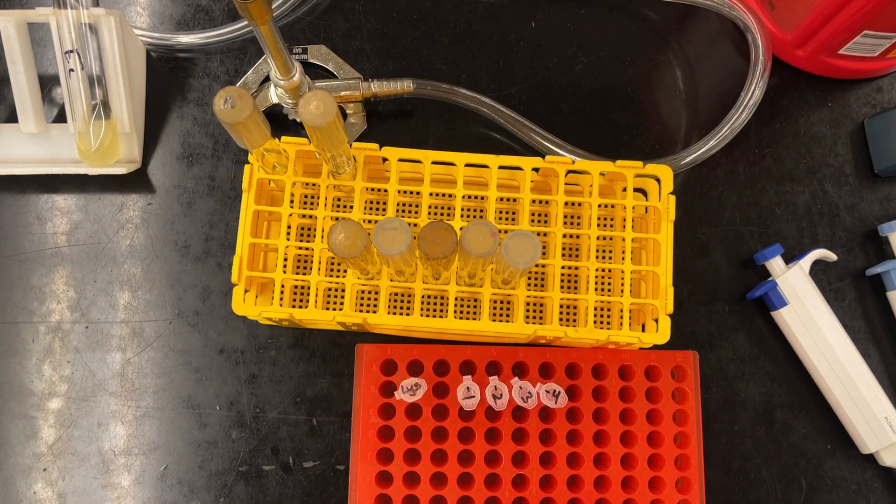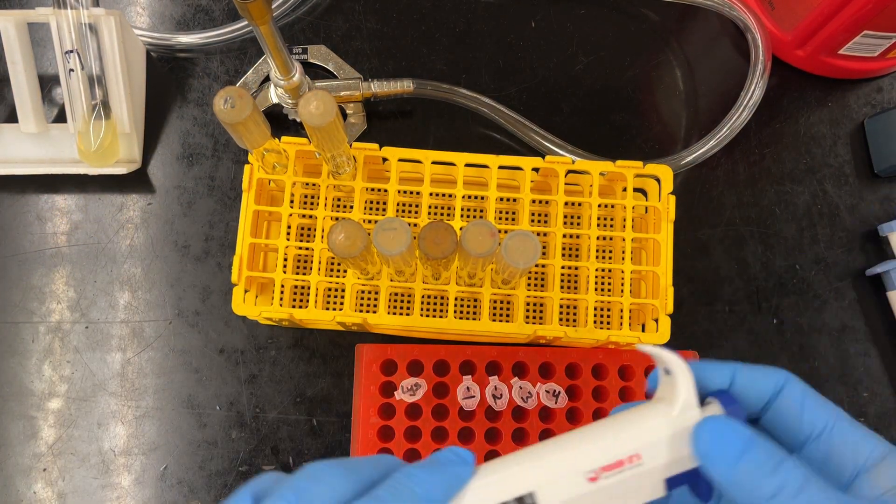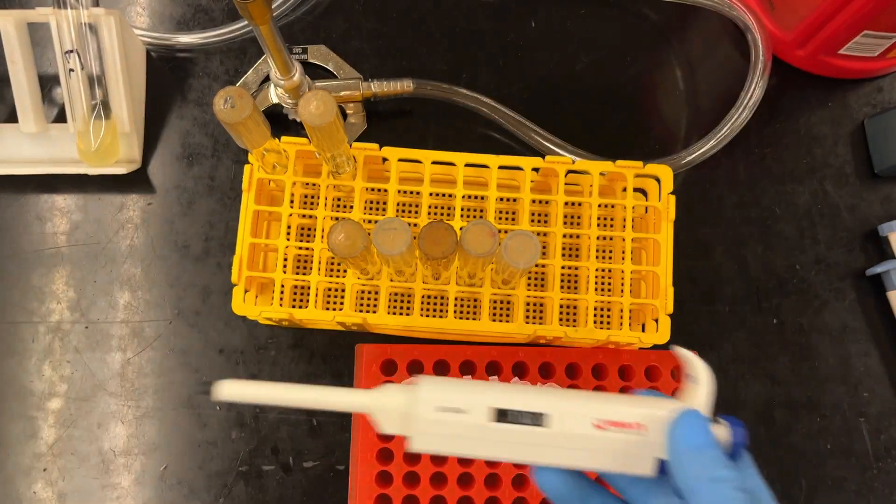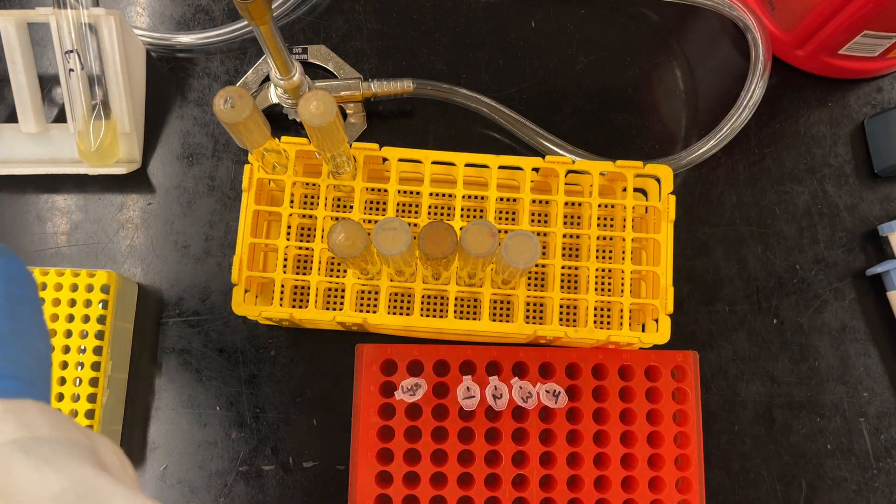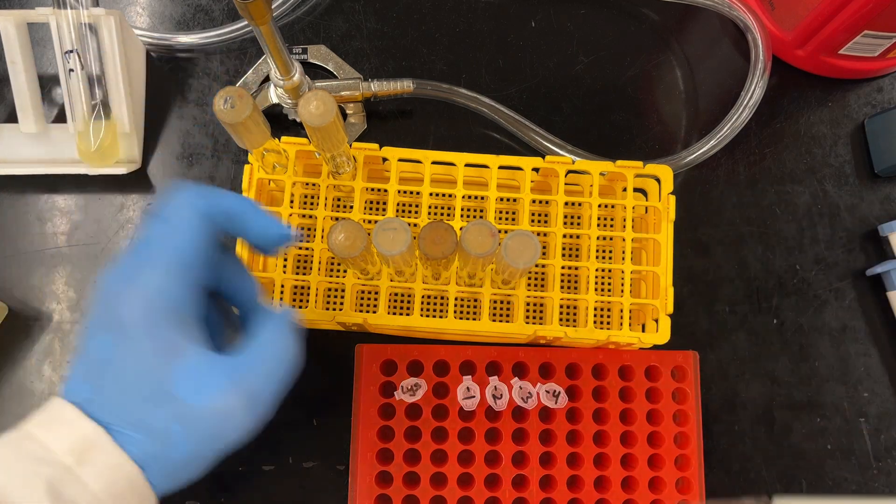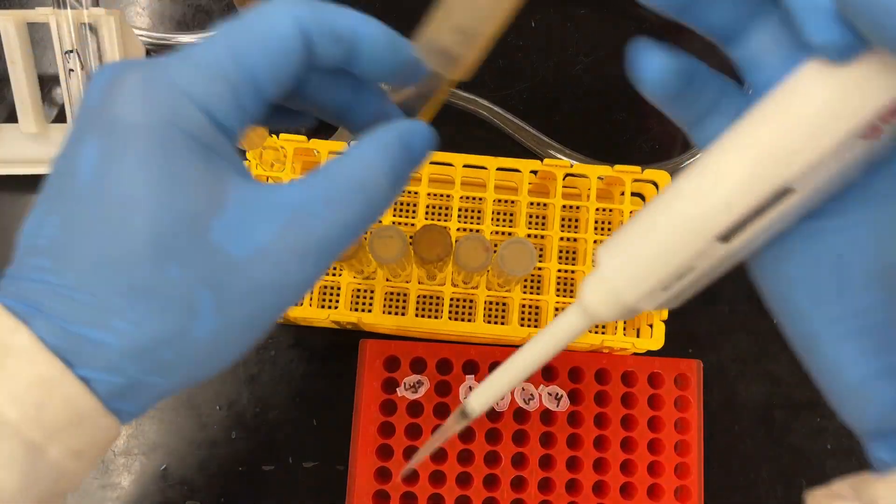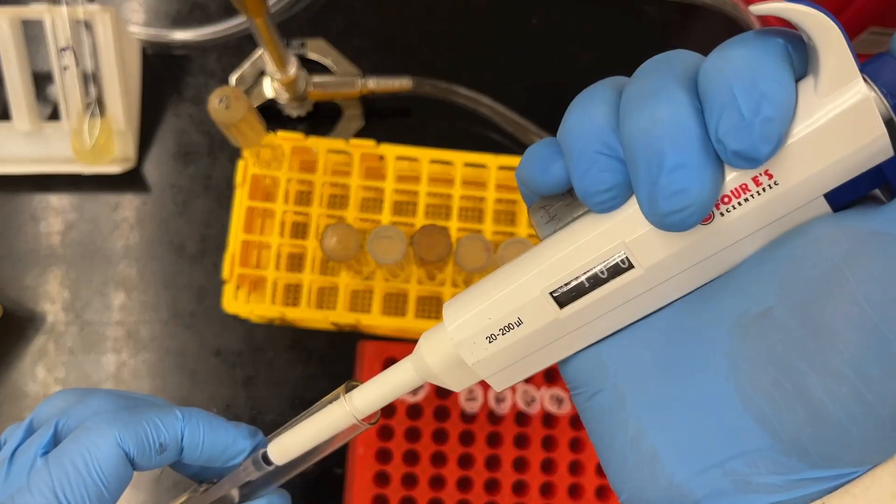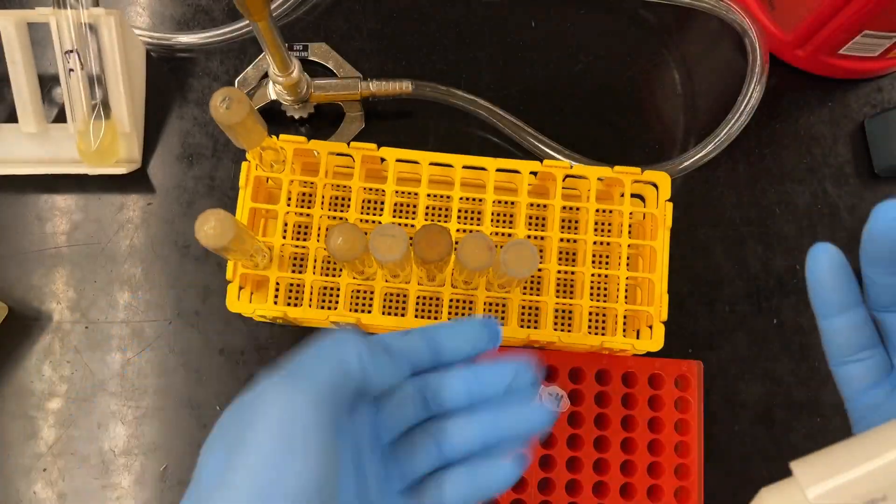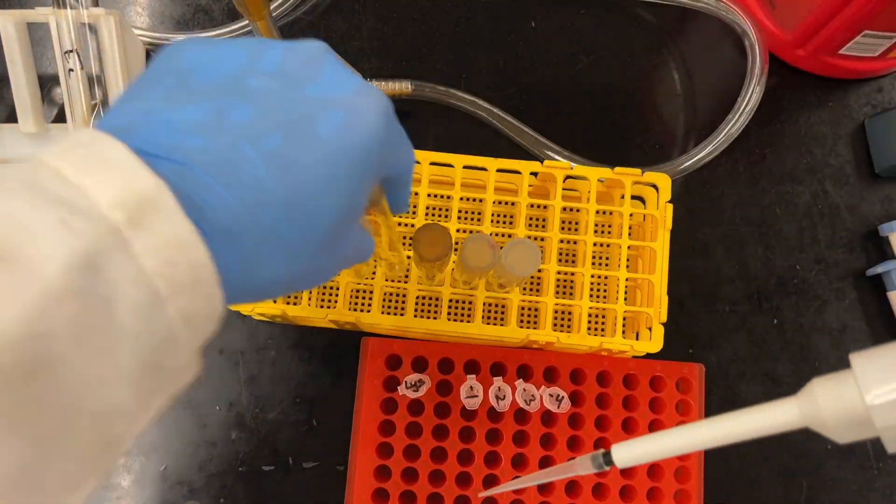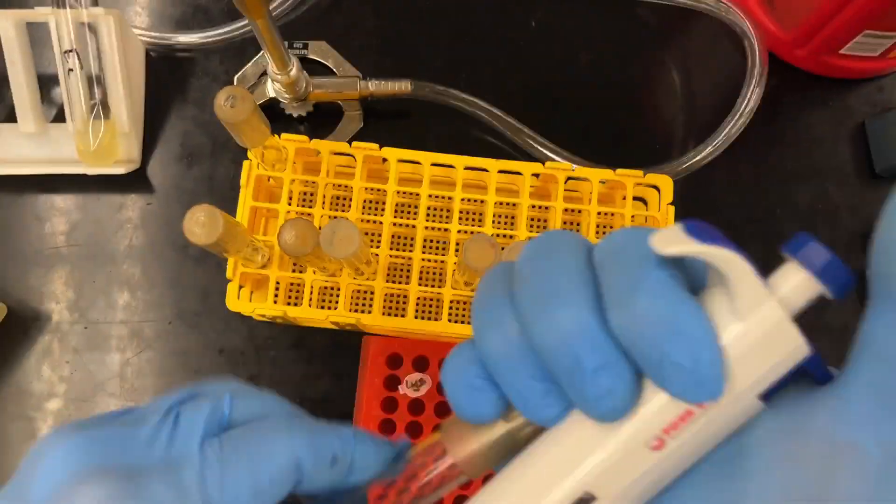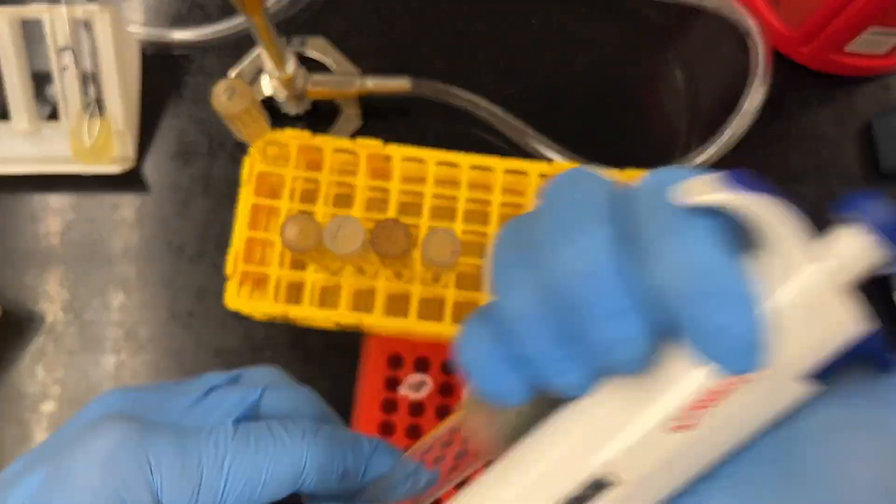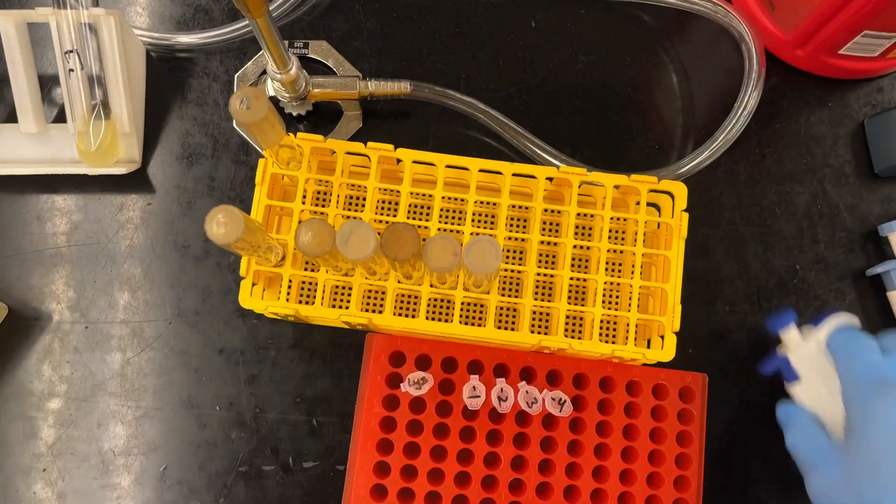And then now we mix everything together. So first things first, we need to add some phage buffer. So we just take 100 microliters of phage buffer and pipette that into every tube. Pretty straightforward. So we have our phage buffer, 100 microliters. And this, once again, provides a nice environment, good salt balance. And then most importantly, the magnesium that allows the phages to adsorb, A-D-S-O-R-B. So 100 microliters into every tube.